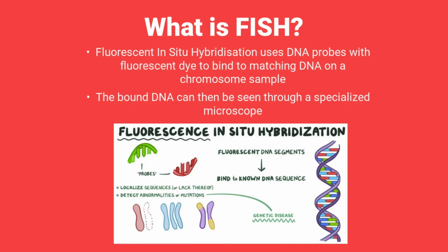The ability of FISH to find DNA sequences to a high specificity makes the technique valuable in medical and science fields, such as the diagnosis of genetic diseases, gene mapping, and the discovery of aberrant chromosomes, as the ability to pinpoint specific DNA sequences has an enormous number of uses.